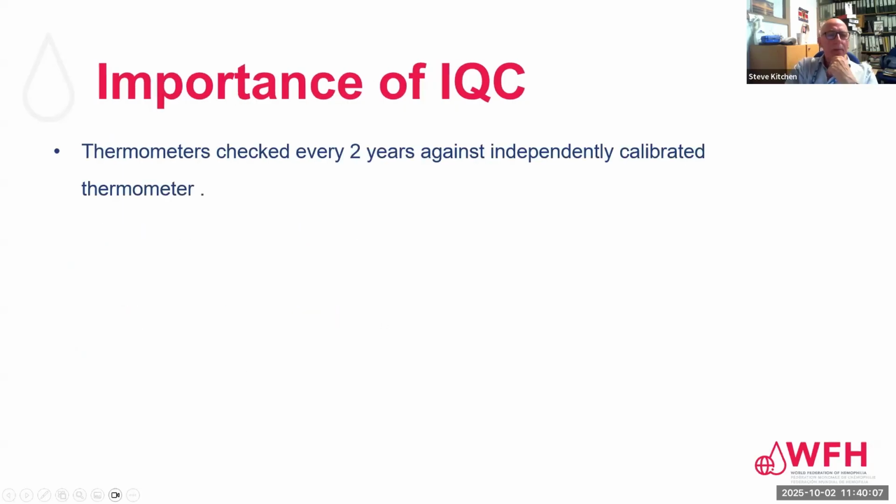So you already will get a clue as to what had occurred here. I'm saying first that the thermometers in use at this time in our center were checked every 2 years against an independently calibrated thermometer. I think it's important to do this, and that's also a recommendation. It's covered in the lab manual. Next slide, please.